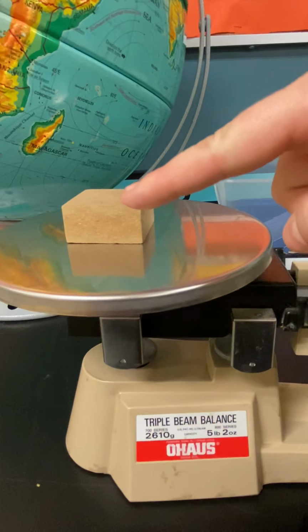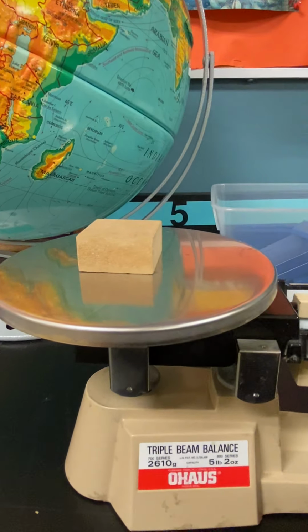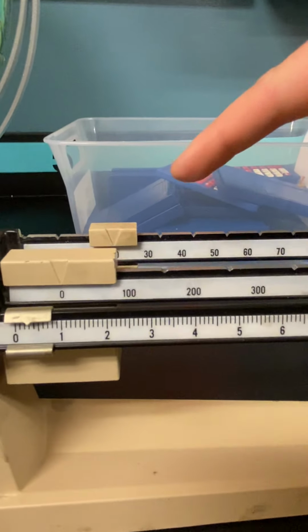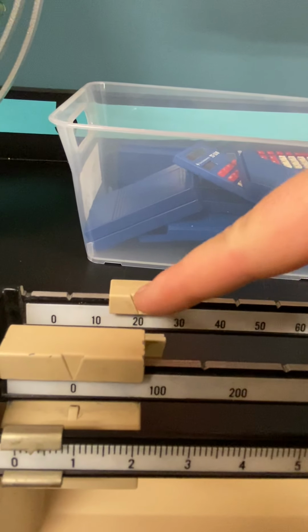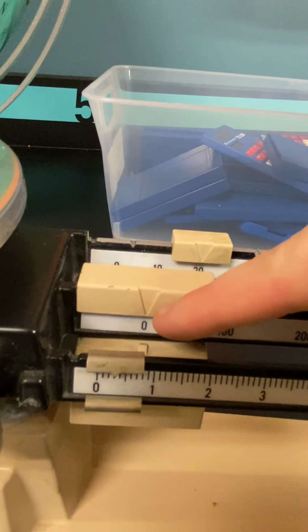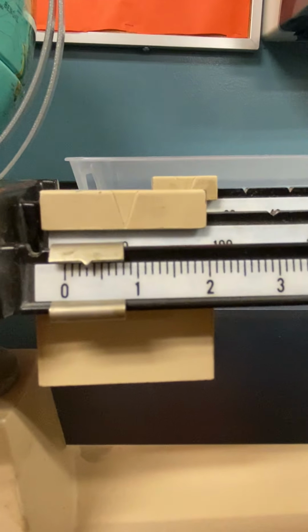All right, now if you look over here, we have our triple beam balances. You are going to measure out the mass of a small block, which I already did for you. Here's our 10 value. And look where the arrow was pointing. Here is our 100 value. Here is our 1 value, right? Give you a little bit to look at that. All right, that's the small block.